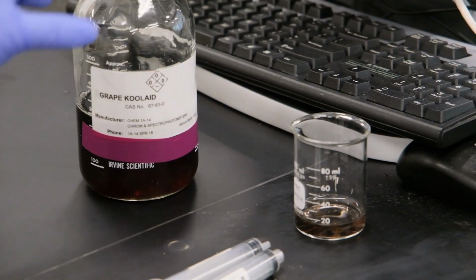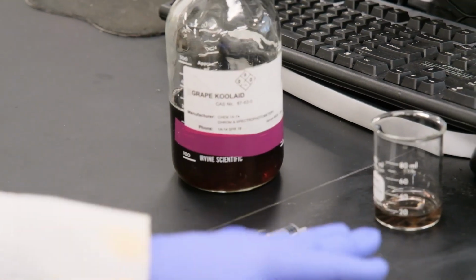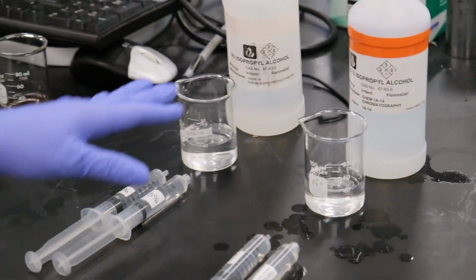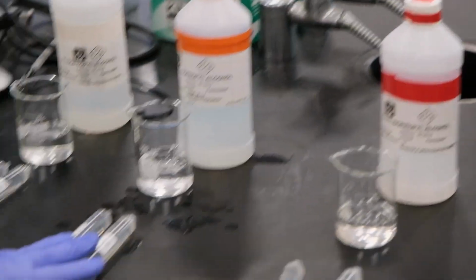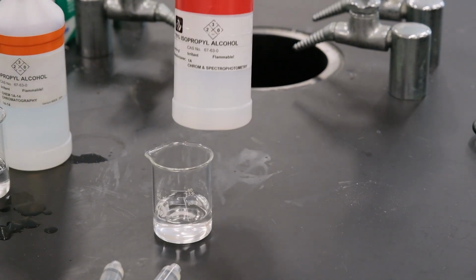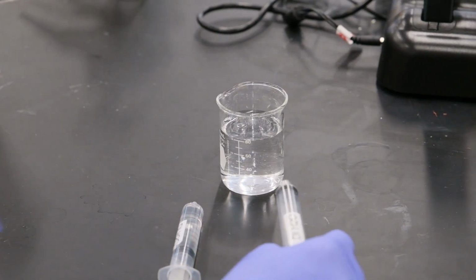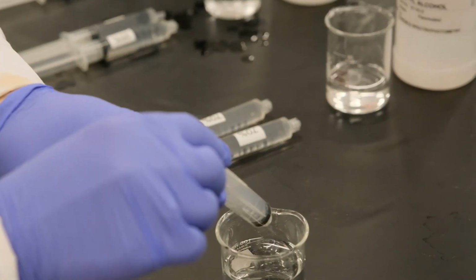The way we are going to do it is we are going to prepare 2 syringes for a series of solutions. So we have the 5% isopropyl solution, and here we have prepared 2 solutions of 25% isopropyl alcohol, and 2 solutions, 10 milliliters in each syringe, of 70% isopropyl alcohol, and 2 more solutions. And I'll show you here how we fill up the syringe to prepare our solution.